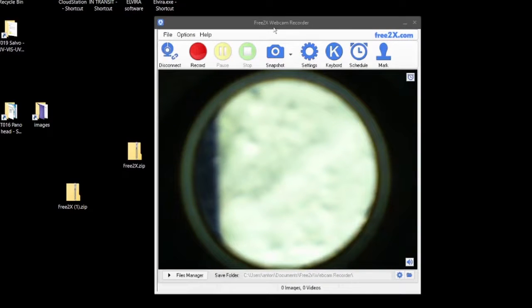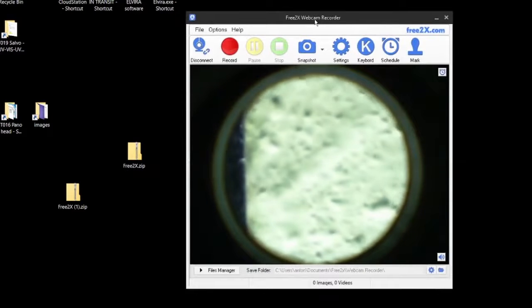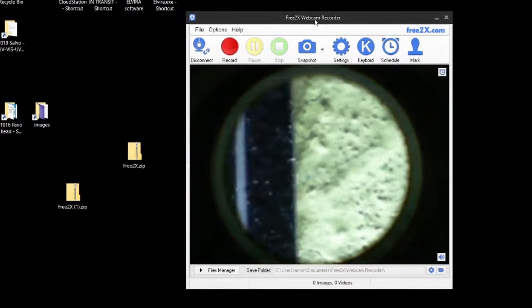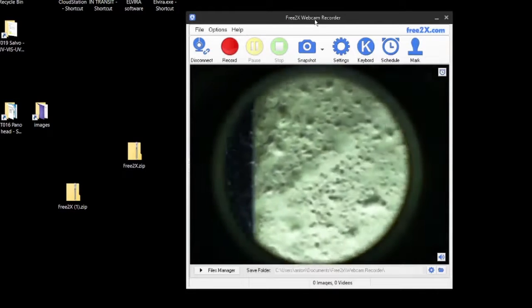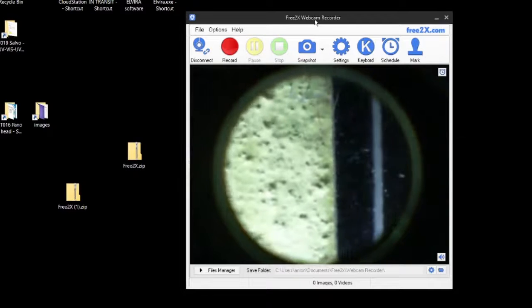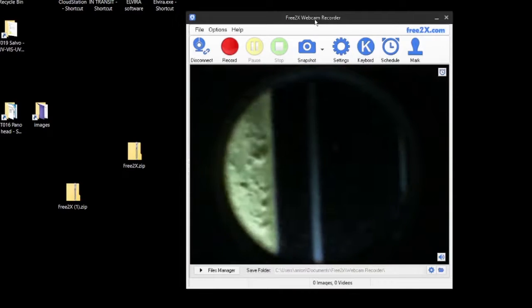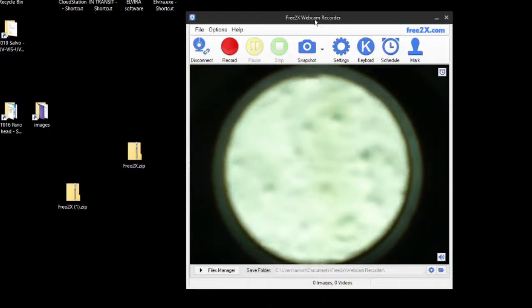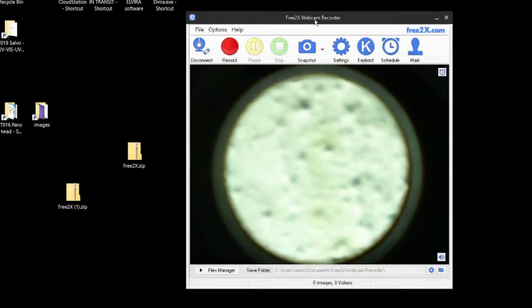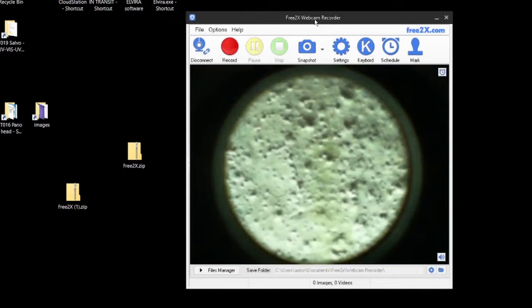There it is. Now you see the camera. I'm getting closer, and there it is. If I slide, this one is the pigment checker. This is another pigment. This is the lead tin yellow. I'm moving into another pigment. Let's go back to lead tin yellow. There it is. I can put this closer to focus, and there it is. So we have a pretty nice image that is in focus.